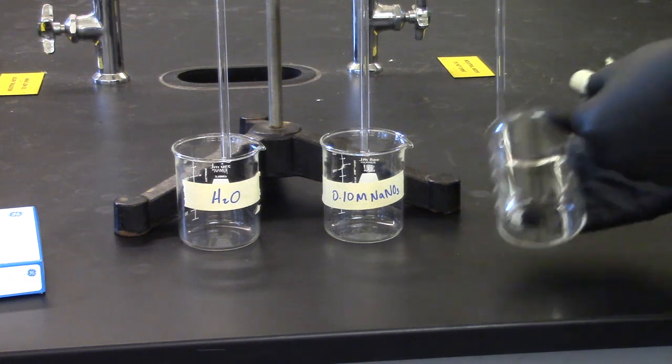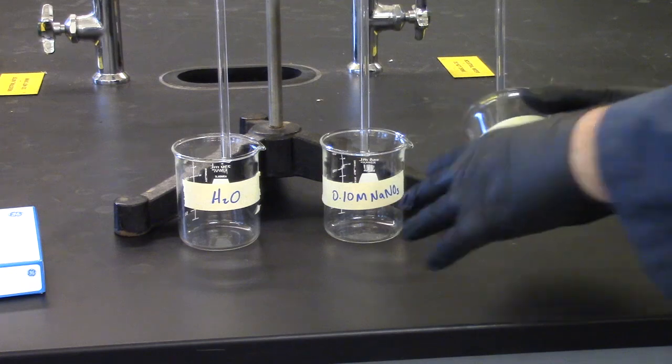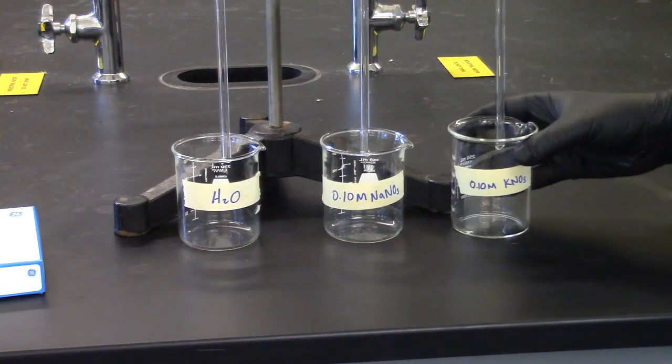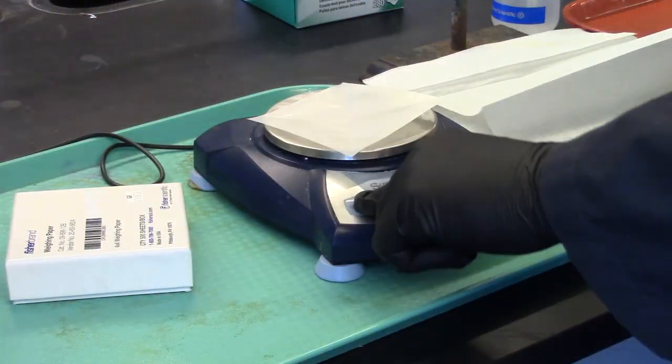Label beakers with the three different solvents: distilled water, 0.1 molar sodium nitrate, and 0.1 molar potassium nitrate to be used to make saturated solutions of potassium acid tartrate, abbreviated KHT, with common name cream of tartar.